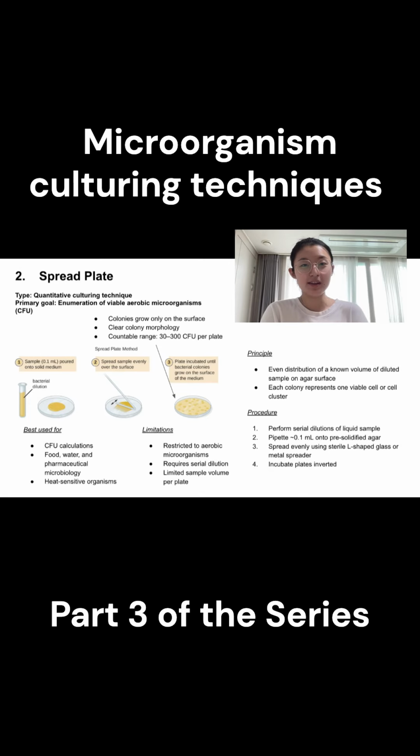The next technique that we're going to look at is the spread plate technique, which is a quantitative technique. Here, the primary goal is the enumeration of viable aerobic microorganisms, which is reported as a CFU, meaning a colony forming unit. The principle is that you place a known volume of a diluted sample on the agar surface and you spread it evenly. And after incubation, each colony represents one viable cell or cell cluster from that plate of dilution.